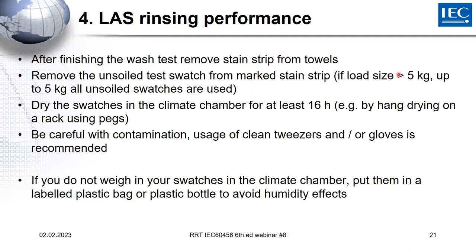The swatches are then dried in the climate chamber. I think drying might not be the 100% correct term. I would say they are climatized in the climate chamber, for instance, by hang drying them on a rack and using clips to fix them, for at least 16 hours. Why do we say do it in a climate chamber? The fabric should have a defined constitution after the drying. If you would dry it completely, you could have almost zero residual moisture in the fabric. If you have it in a more humid condition, it might be 7 or 8%, and this would of course then be a difference in the weight of the swatch. And that's why, if you want to have defined conditions, we said do it in a climate chamber.